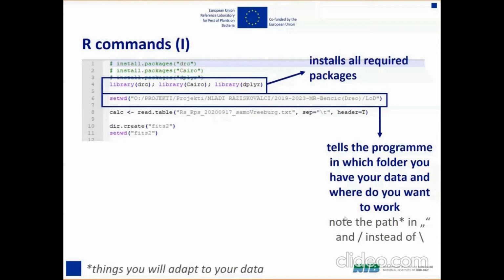And the path is the thing that you see when you are opening folders on your computer, in this address line, path line. The only thing that you have to do is copy that when you have your own data stored somewhere else. Of course, you will not have this exact name. You just copy it, and then you just have to change this slash for the other slash. Sorry, I don't know the English words.